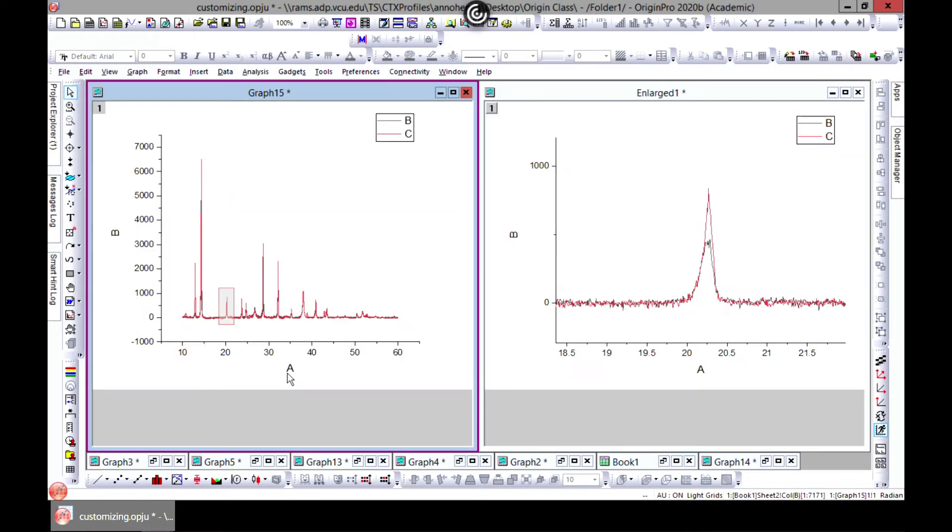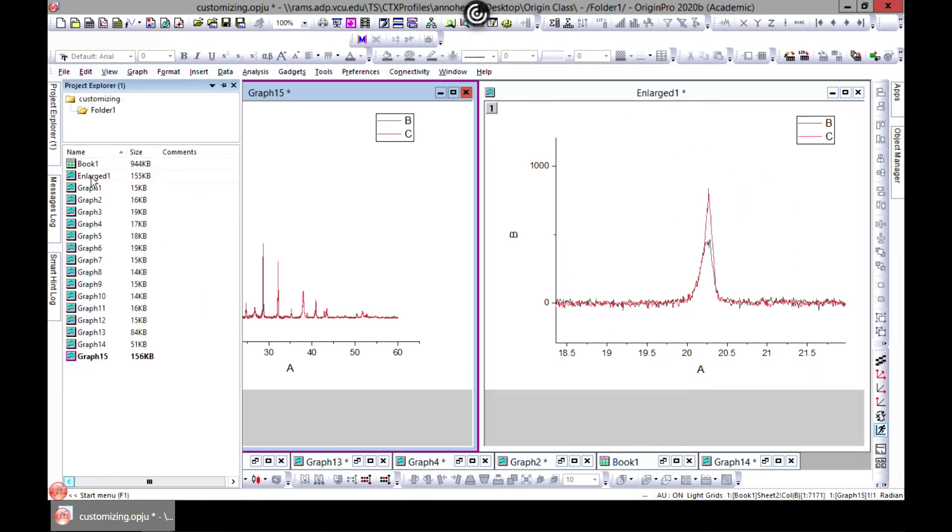Then a new enlarged window will pop up which will be here for you. So you have an enlarged window.